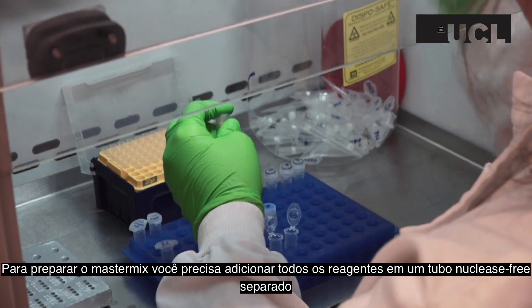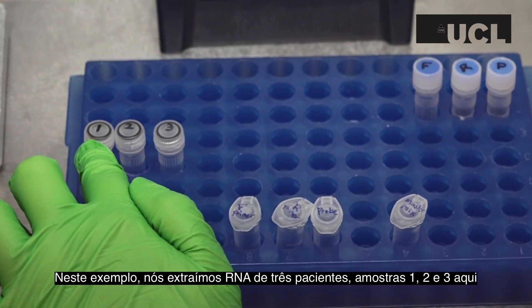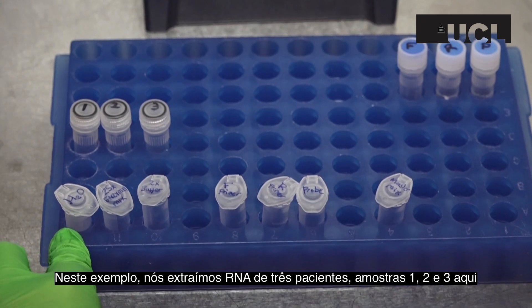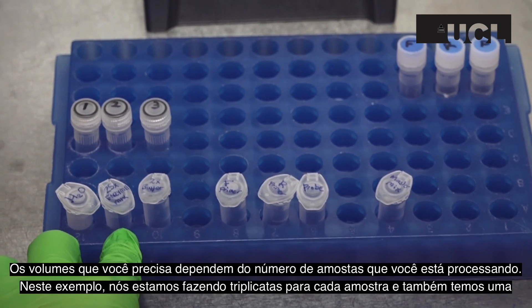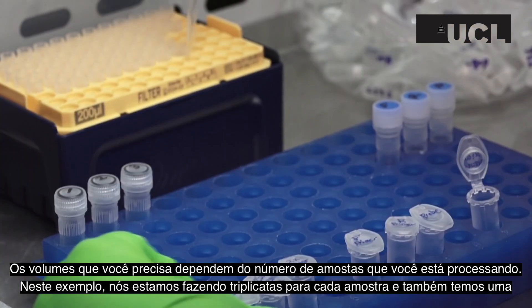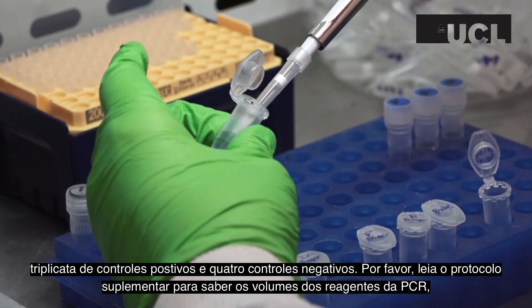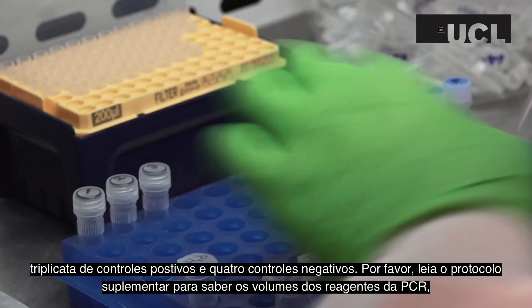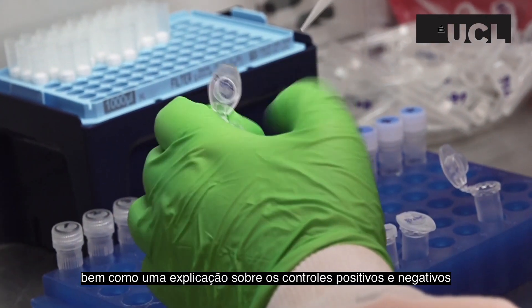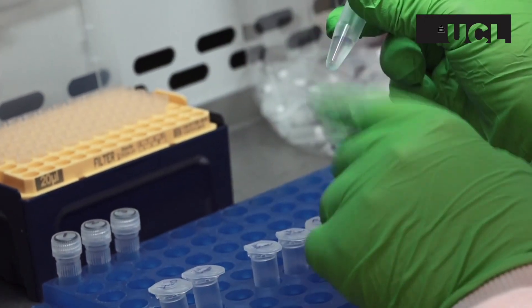To create your master mix, you will need to add the reagents to a separate RNase-free tube. In this example, we have extracted RNA from three patient samples labelled 1, 2, and 3. The volumes you will need depend on the amount of samples you are processing. Here, we are repeating each of our three samples three times, as well as having three positive controls and four negative controls. Please refer to the supplementary protocol PDF for the PCR reagent volumes needed, as well as an explanation about positive and negative controls. Mix the master mix well by pipetting or gently flicking the tube.